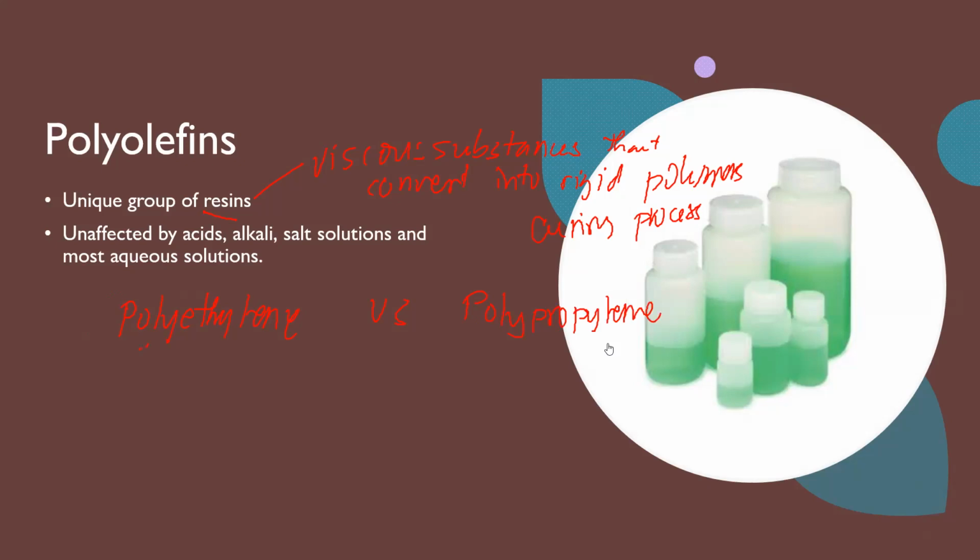Okay, so you have your polyethylene and your polypropylene. Now, what's the difference between the two? Take note, guys, that polyethylene plasticware cannot, no? I am writing it in caps lock para matandaan mo. Polyethylene cannot be autoclaved. And may tatlong exclamation mark so that you will remember that polyethylene plasticwares cannot be autoclaved.